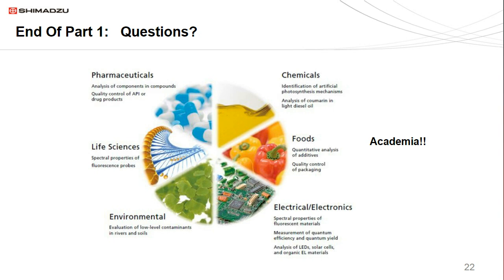Thank you. Let's do another question. Here it is. How exactly do you get rid of the Raman peak with a filter?